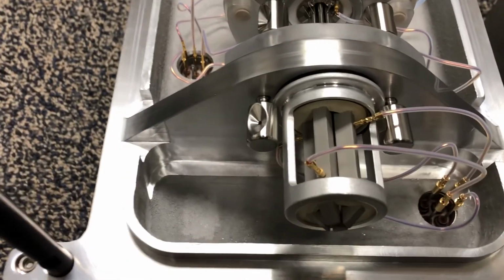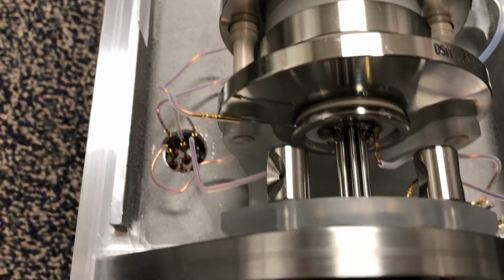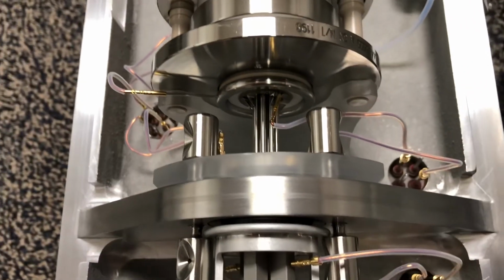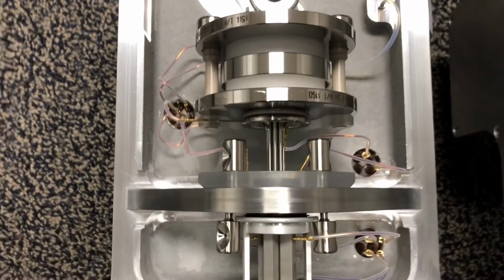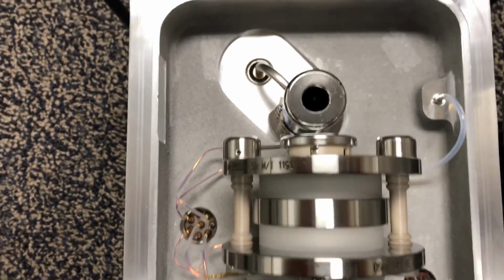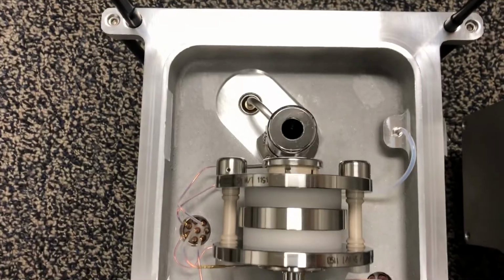Now, the ions fly through the quadrupole ion guide, and then past the quadrupole ion guide, we have an octupole. That's an octupole ion guide that also helps to focus the ions. And then it moves from there into that disc-shaped guide. That is actually an ion trap. That's the mass analyzer. It flies out the end of the mass analyzer sorted, and that hole is the detector.